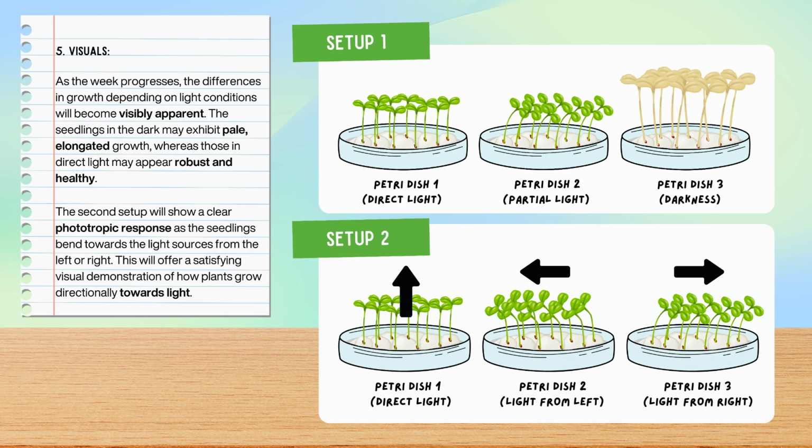Watching the seedlings respond differently to varying light conditions offers a fascinating insight into the role of plant hormones in growth and development.